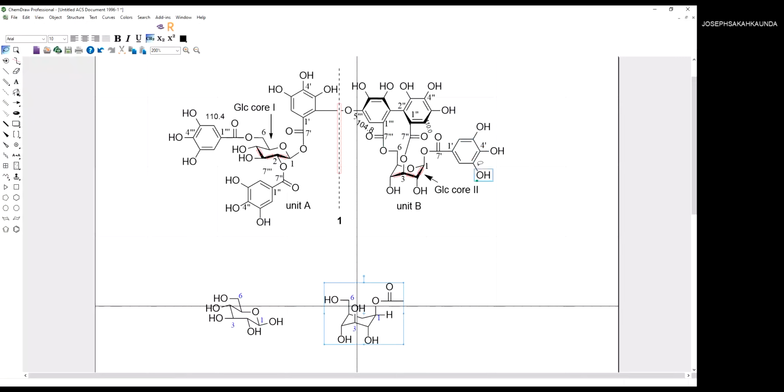So once you've gotten that, usually you'll find that this one is larger than this. So you'll find this proton correlating with this carbon, this carbon, this carbon. Because this and this are the same. So once you find one, that one, just fix it automatically. This one is so easy because in this ring, this is the smallest.